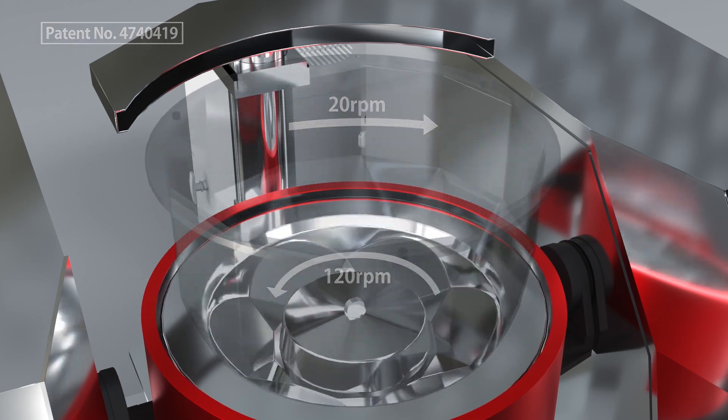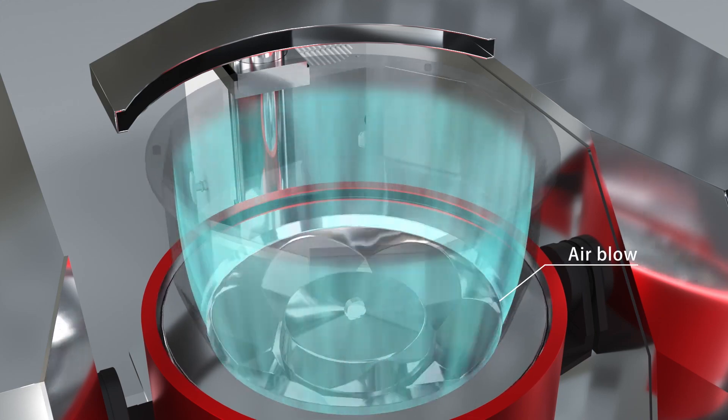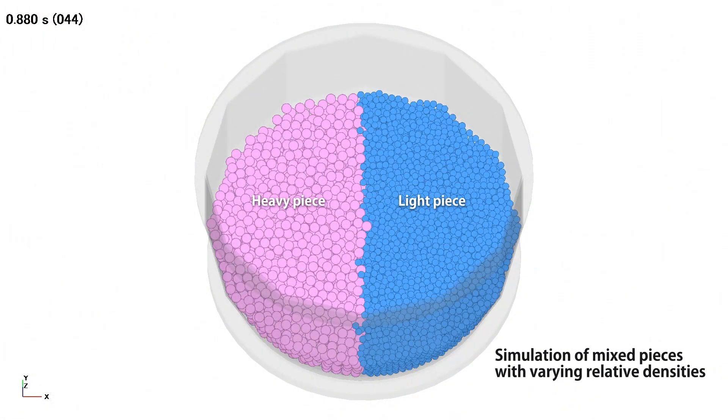The drum slowly rotates in the opposite direction. Additionally, air is uniformly blown into the processing chamber from the outer edge of the disc to prevent fine powder particles from falling. The pieces rise along the inner walls of the disc and drum due to centrifugal force, and roll down the flow surface from the top edge due to gravity. This repeated motion creates uniform vortex flow.